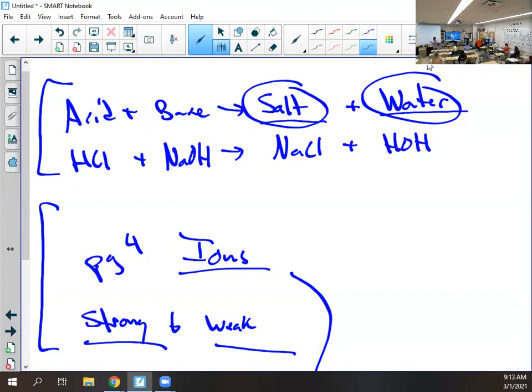So back right where Savannah's sitting, you'll see a bunch of household products. You just come grab a tray. There might be one at your station and just don't take the like lemonade pipette to your station. Just fill up 3 wells of it and then get out of the way. So make sure you keep track of what you're doing. That's a really dumb way to fill it up. Just go down, not across.